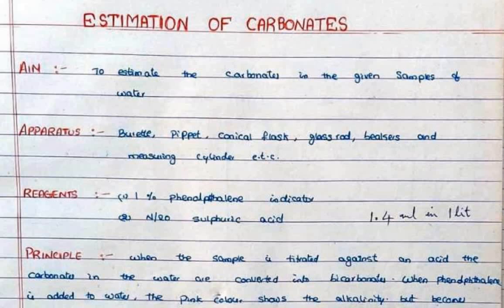So next, estimation of carbonates. Aim: to estimate the carbonates in the given sample of water.